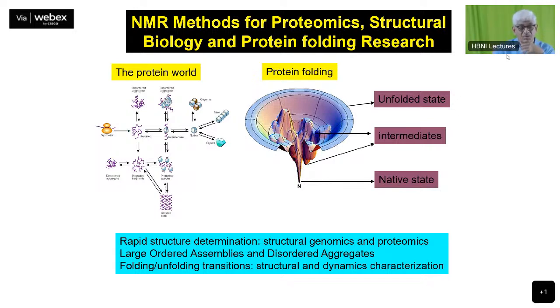We started from the basic units of nucleotides and how they are connected, and how to use NMR to characterize the structure of nucleic acids. We discussed DNA, RNA, the different types of structures, their characteristic features, and how they show up in the NMR spectra: 1D spectra, 2D spectra, even the proton spectra.